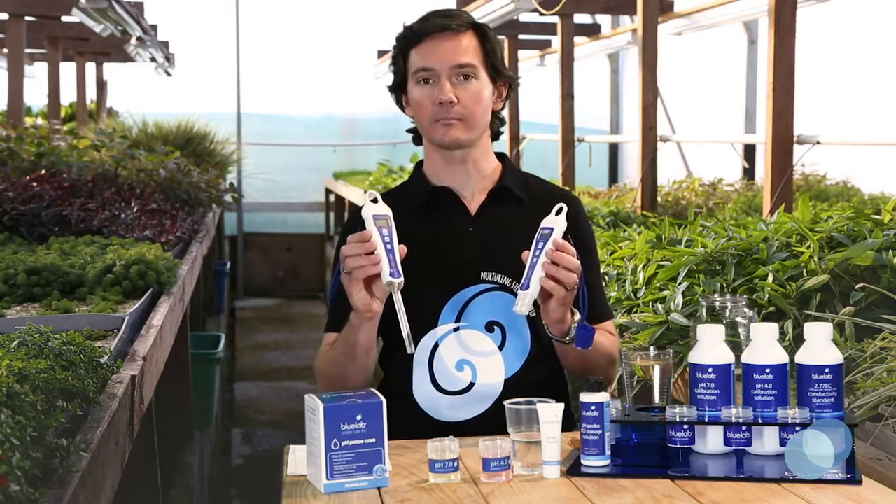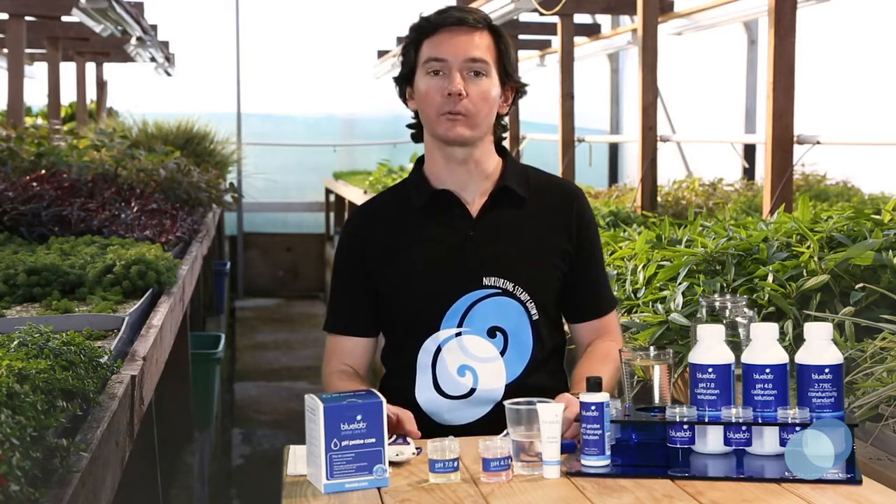Remember that the calibration steps for the standard pH pen and the soil pH pen are the same. Also remember that you should always calibrate starting with a pH 7 solution first.